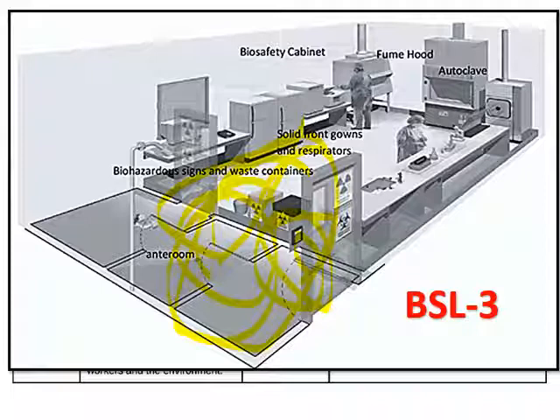But when things go out of the lab, nothing is allowed to come out of a BSL-3 lab or a BSL-4 lab that hasn't been autoclaved. So over here in the corner, we have an autoclave that has two doors. One door faces the inside of the lab and the other door faces the outside. Again, the two doors can never be open at once.